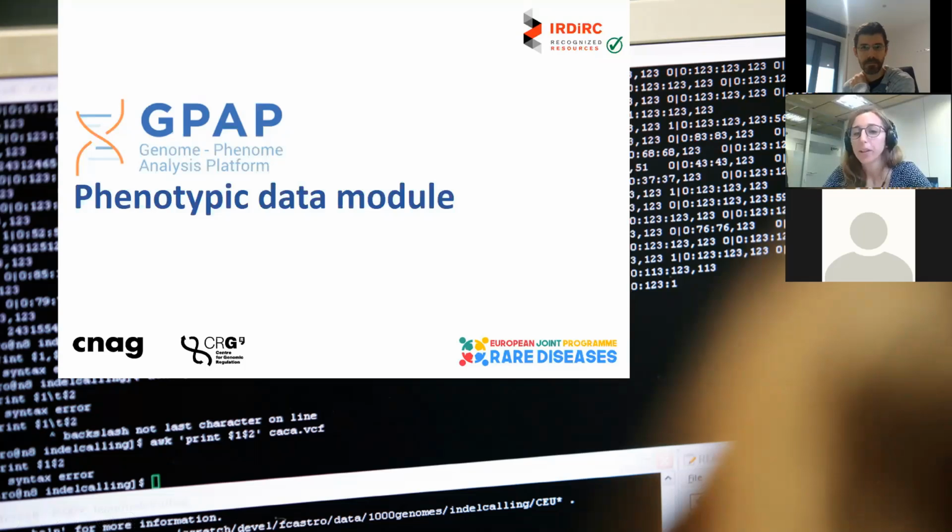So during the next half an hour or so, the idea is to first give a very short presentation on the key features that we have developed within Phenostore, this phenotypic data module. And then I will be giving also a short demo on how to enter a case in the system. And after that, together with Stephen Lowry, who is here with me, we'll be answering questions, and we are also open, as Sergio mentioned, to discuss other features that you think could be interesting to have in the system and that might be missing at this stage.